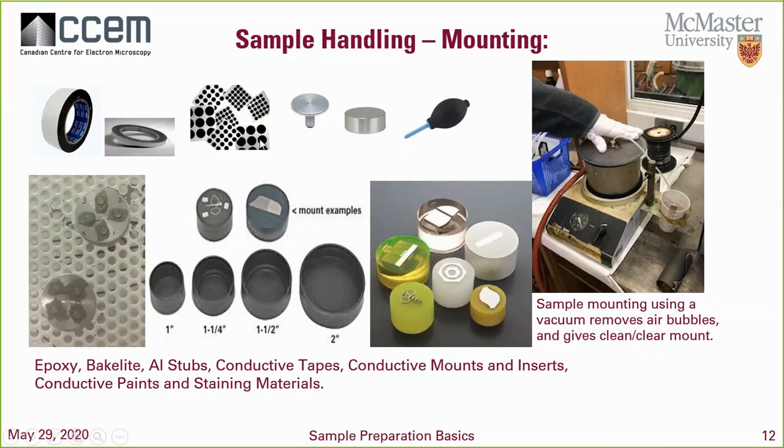The inserts can be used as markings. One tip that I want to give everyone is if you mount your plastics while using a vacuum, it gives you an extremely clean mount, as you see here, and it allows you to see exactly where the sample is, which I think is huge. And you can mark the sample better that way as well. At the same time, you get rid of those bubbles that could add contamination to the surface. You don't have to clean the surface as much. As long as you give it an alcohol rinse, you'll be okay.